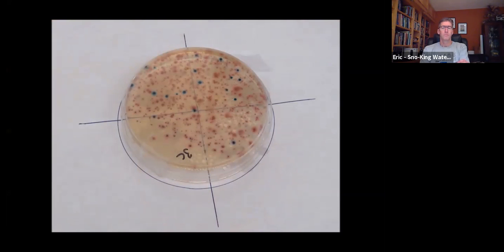Count or estimate the number of all pink to dark red colonies on each plate as other coliforms. Estimates of more than 100 colonies should be reported as abundant, and estimates of more than 200 colonies should be reported as too numerous to count. This sample should be recorded as too numerous to count.